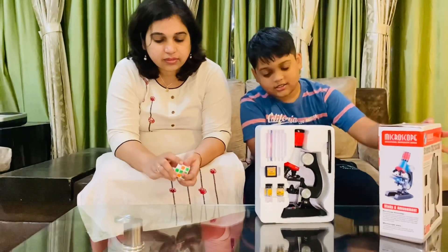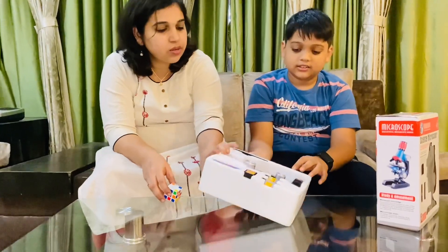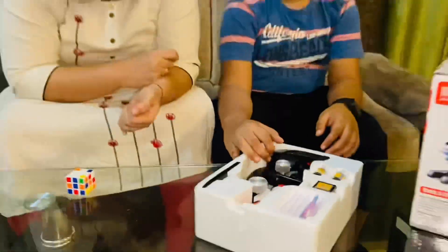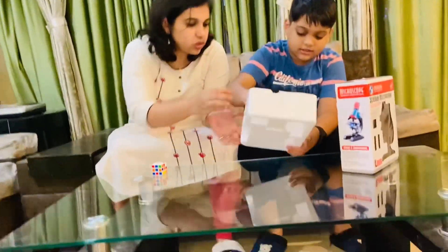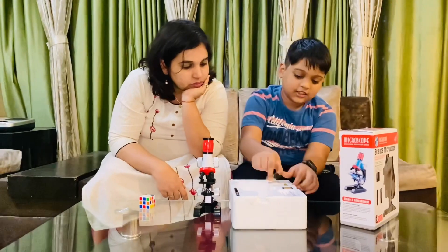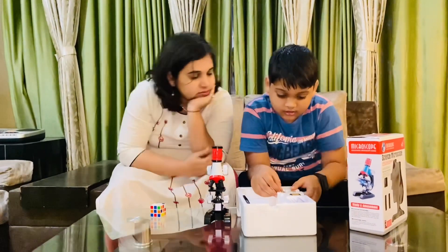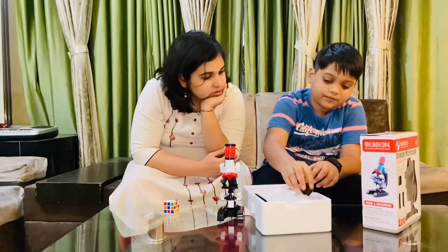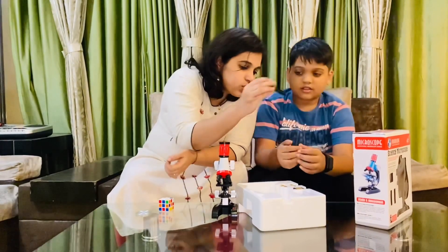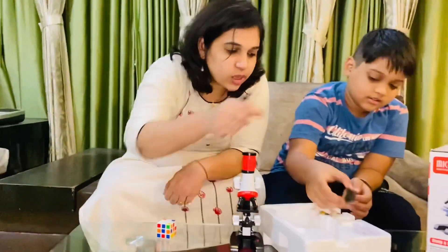These are the materials inside the kit: specimen glass, a microscope, two collection bottles, a container for the slides, the slide itself, and four cover slips. You use the cover slips to collect a sample — you put the sample on the slide and then cover it with the cover slip.